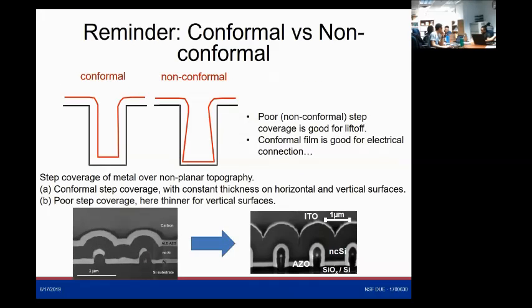So remember the conformality problem, the deposition problem. For those different deposition methods, we were not able to get a conformal coating like this. The sidewalls would not be coated at the same rates, right? And I told you one more thing, that this was the research problem that I was working on. I was trying to deposit on this whole little nano post here with silver. But as you can see, I wasn't very successful in coating some portions.